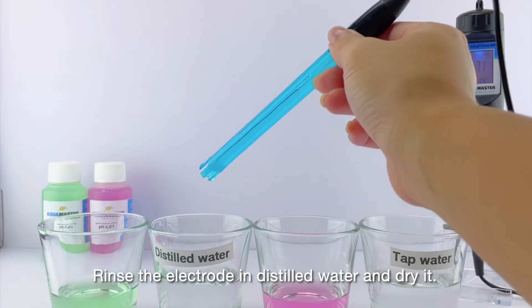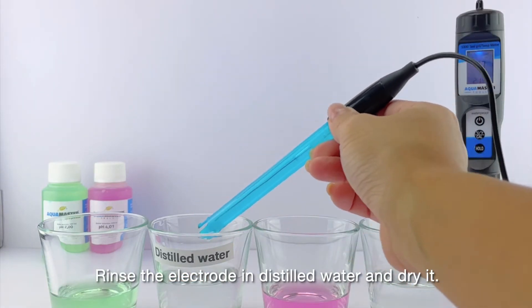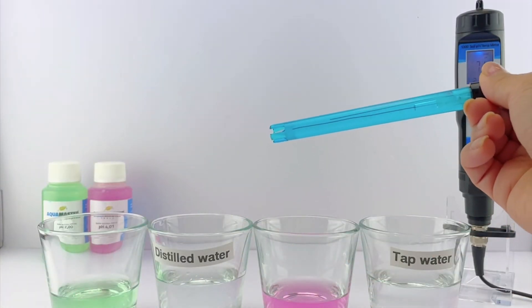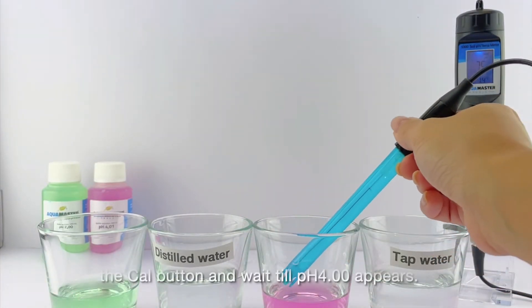Rinse the electrode in distilled water and dry it. Place the electrode in the pH 4.